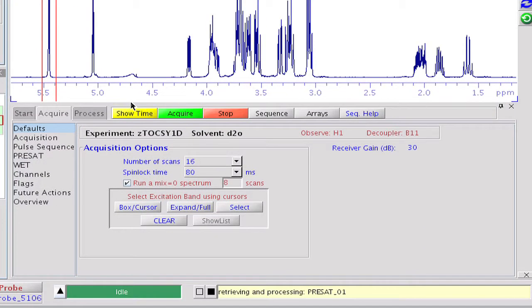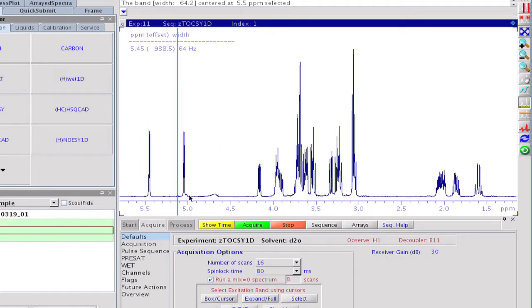Let us start with one of the anomeric signals at 5.5 parts per million. We position the cursors and click on the select button. In the top left corner of the graphics canvas, we can monitor what has been selected so far.